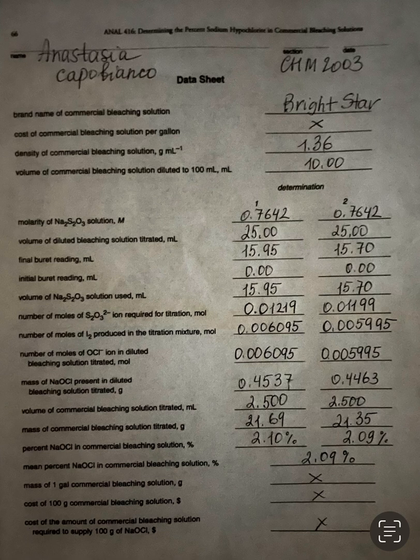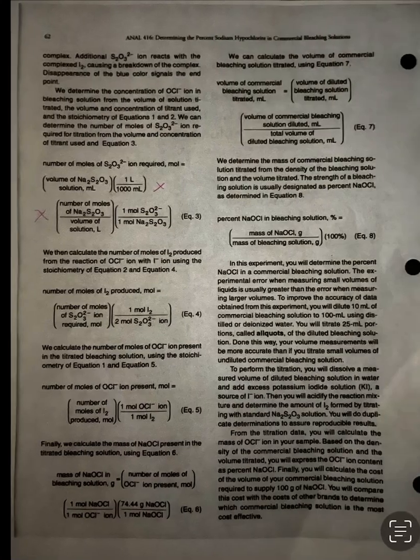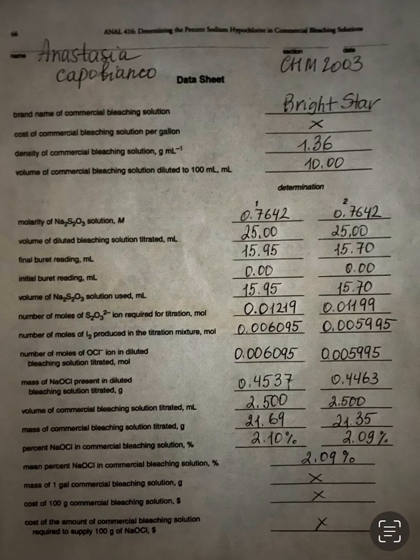And we can take a look. We used 25 milliliters. Okay, then you have to multiply by the volume of commercial bleaching solution diluted. Let's take a look. Volume of commercial bleaching solution diluted to 100 milliliters was 10. And in the end, we got the total volume of diluted bleaching solution, 100 milliliters. Okay, so 25 multiplied by 10 and divided by 100, and you'll get your volume of commercial bleaching solution titrated in milliliters. It is very important that you keep it in milliliters.